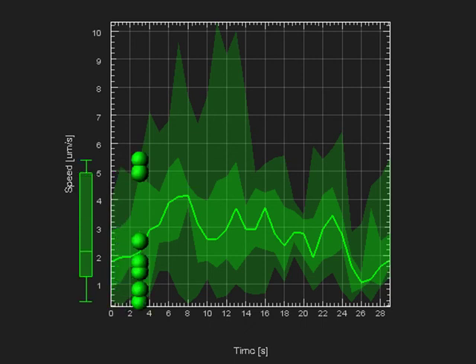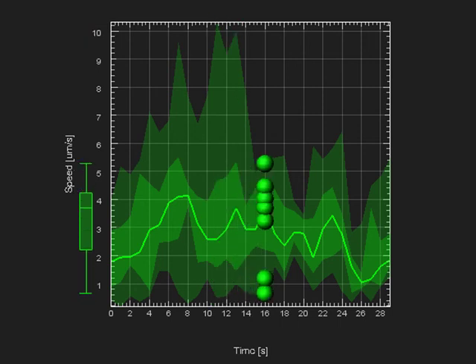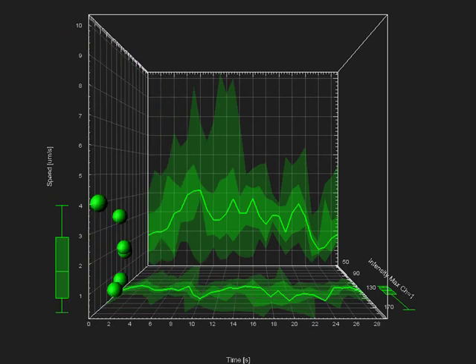When using the time plot type, the box plots represent a moving statistical summary. The box plot position and shape changes at each time point. Moreover, the 2D summary plot projections XY, XZ show colored regions and lines. These represent the 5-number summary of the selected variable over time.